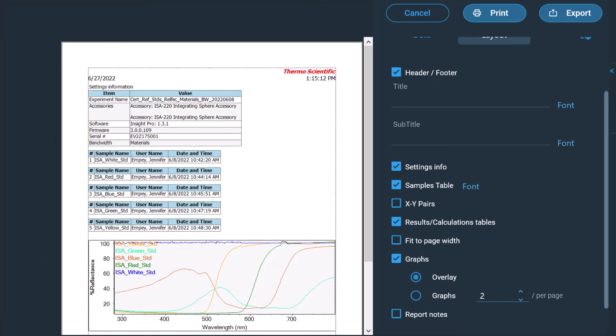A data report can be generated including the data graphs, instrument settings, user, and calculations performed using the instrument software. The measured data and report can also be exported manually using the same file formats described earlier and read in the appropriate program.